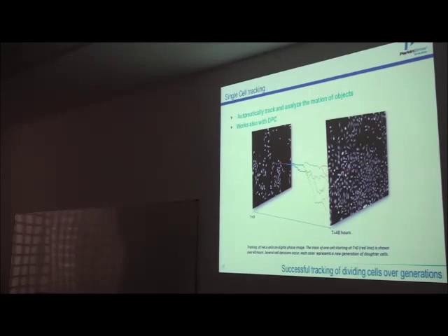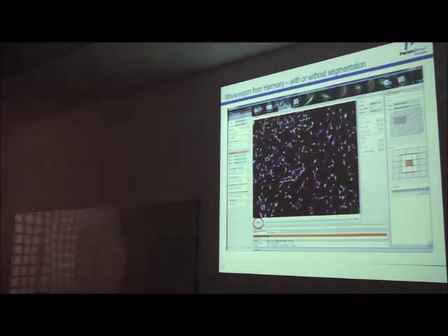Last but not least, at the end of your measurement, the end point, you can actually relate it back to the original cell. For instance, this is the parents, first generation, second generation, etc. Because for this cell still, you get the information from this one. So this is for tracking and back tracking.